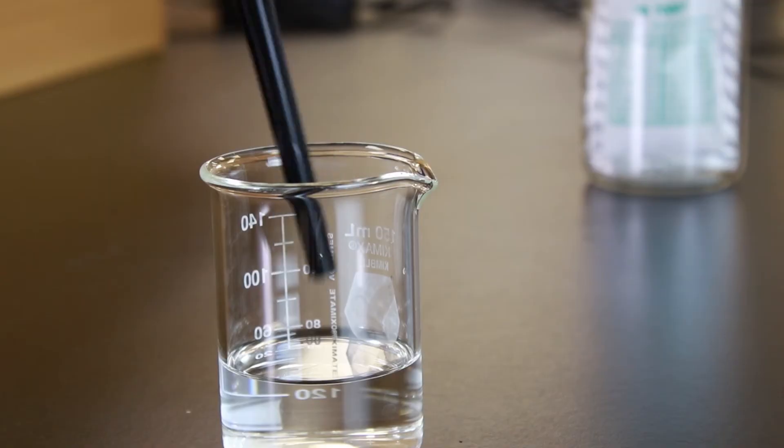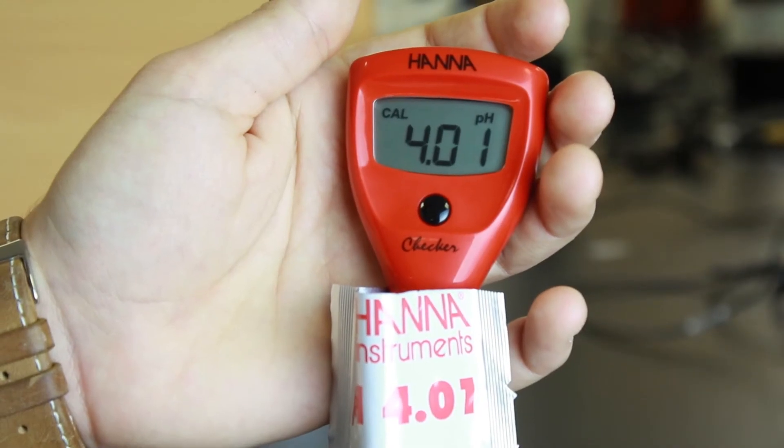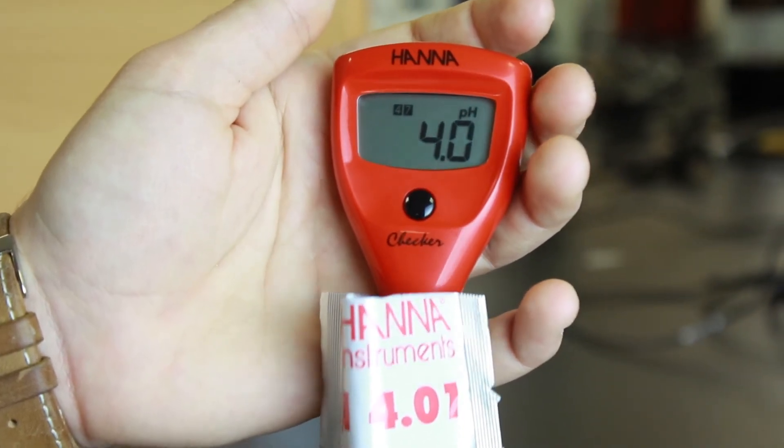Once the first point is done, rinse the electrode in distilled water. Then enter it in the second buffer. After the meter is done calibrating, it will automatically return to measurement mode. Now you're ready to start testing.